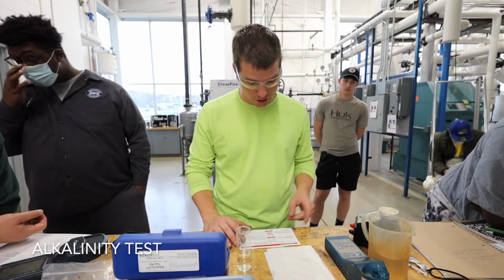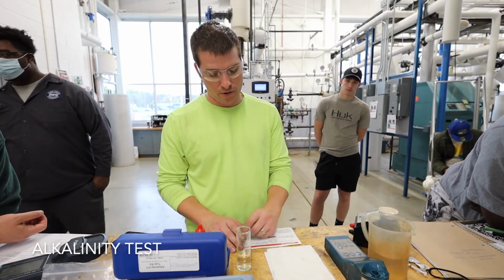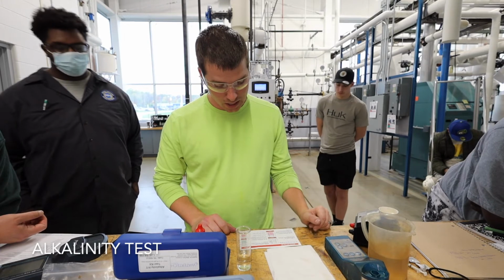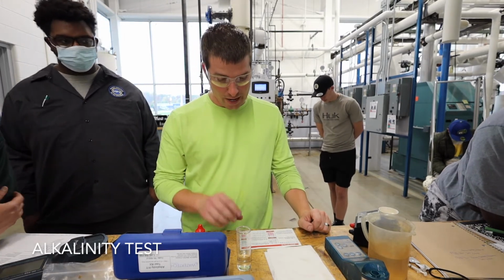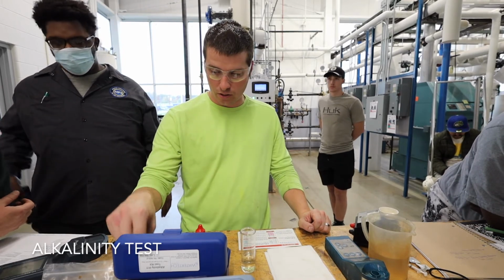So this is where it gets a little tricky. Step 3, we just determined our P alkalinity. So you would write that down and say we have 200 on your sheet. Now we go to step 4. We do not dump this, we continue on. Add 3 drops of total alkalinity indicator.